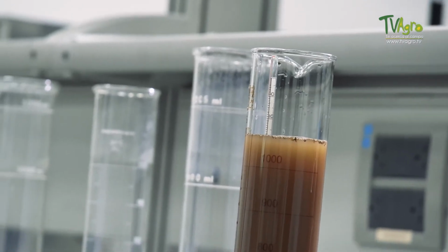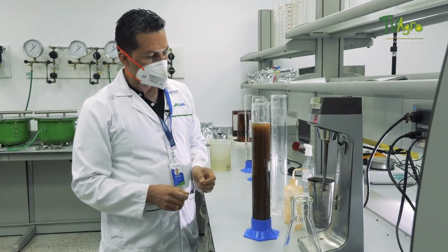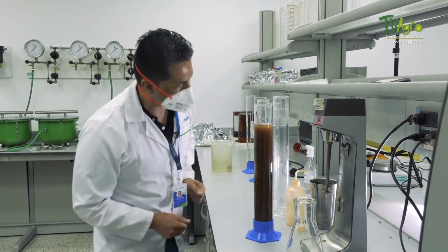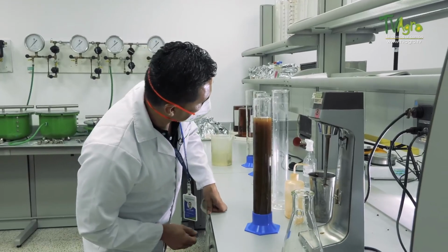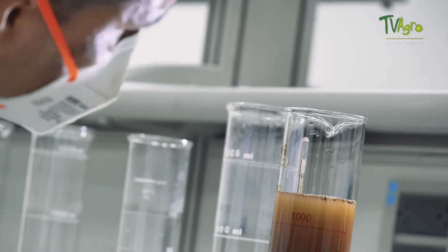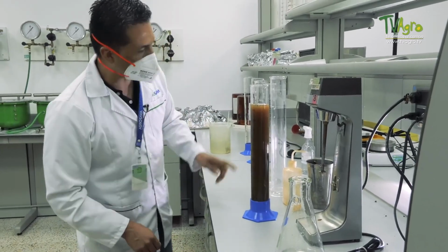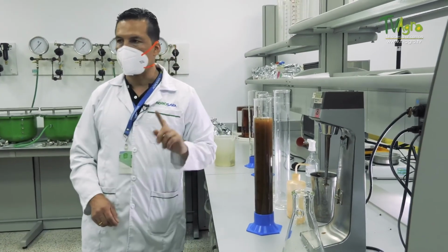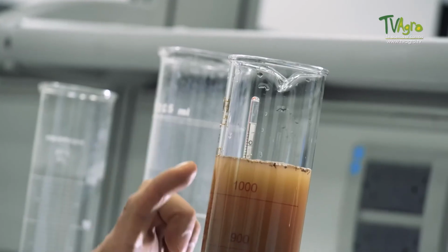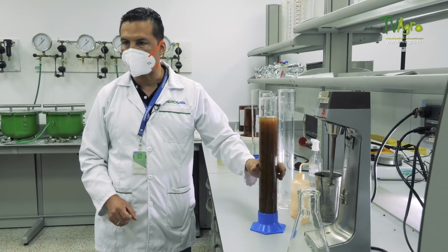So initially we take a reading in 15 seconds, which will be the initial density of the soil. But then we check the surface of the water with the indications of the scale. We take the note, and in 2 hours we make another measurement. Logically, in 2 hours all the sands are first decanted and so on.